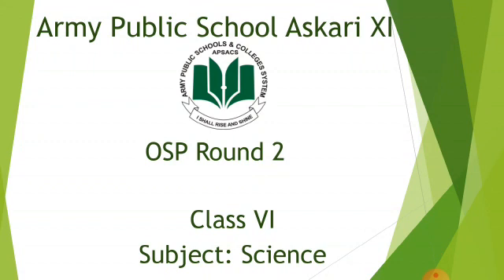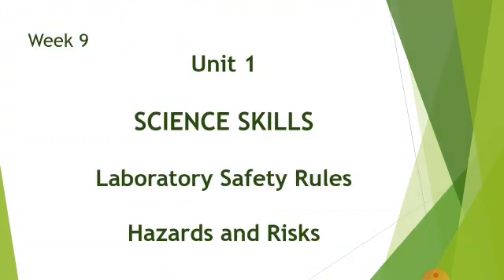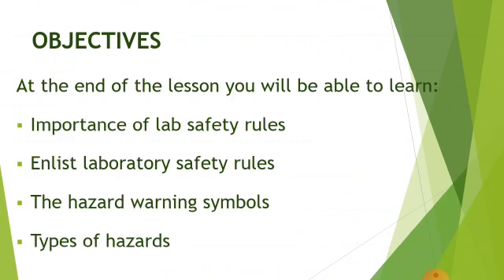Today's lesson is really very interesting. Let's see what it is. It is about the Unit 1 science skills, and the topics which we are going to study today are laboratory safety rules and hazards and risks. At the end of today's lesson, you will be able to learn the importance of lab safety rules. You will enlist the laboratory safety rules, the hazard warning symbols, and types of hazards.